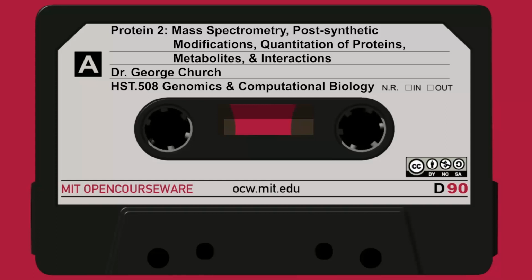Okay, so now we've gone through the richness of the separation methods. Separation is intimately connected with getting us to a mass spectrum which is clean enough to do either de novo sequencing or database searching. Now that we've got it identified, let's try to quantitate it. We can quantitate it one of two ways, just the same as with the RNAs, either on an absolute scale or on a relative scale. What is involved?